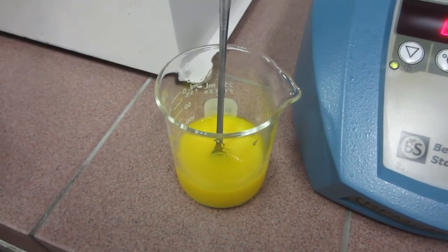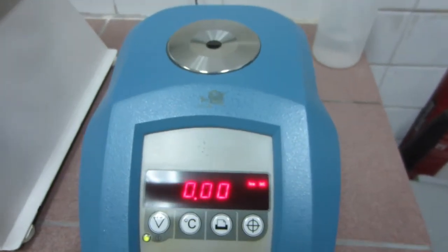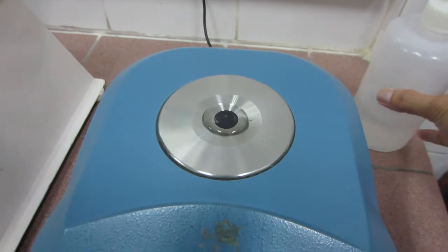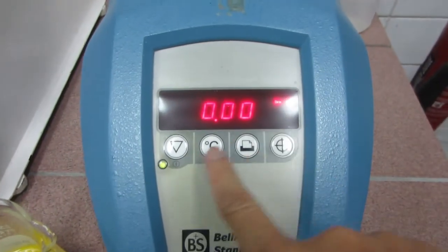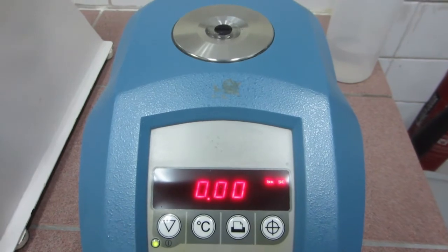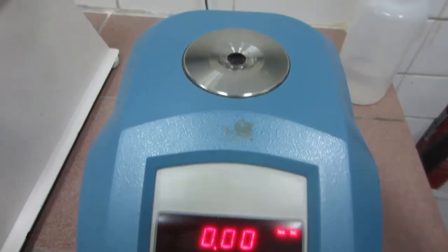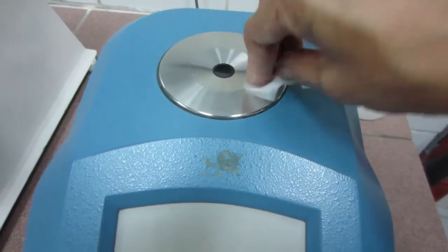So this is the refractometer. I have my liquid solution — it is a sample of a liquid beverage — and let's see what is the sweetness of this liquid. First, this is distilled water, and water always reads zero. So it is zero; it has no taste.